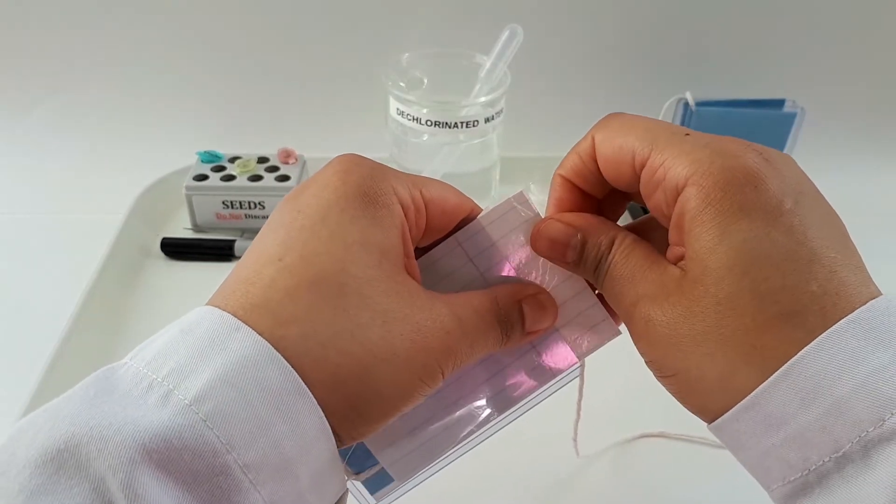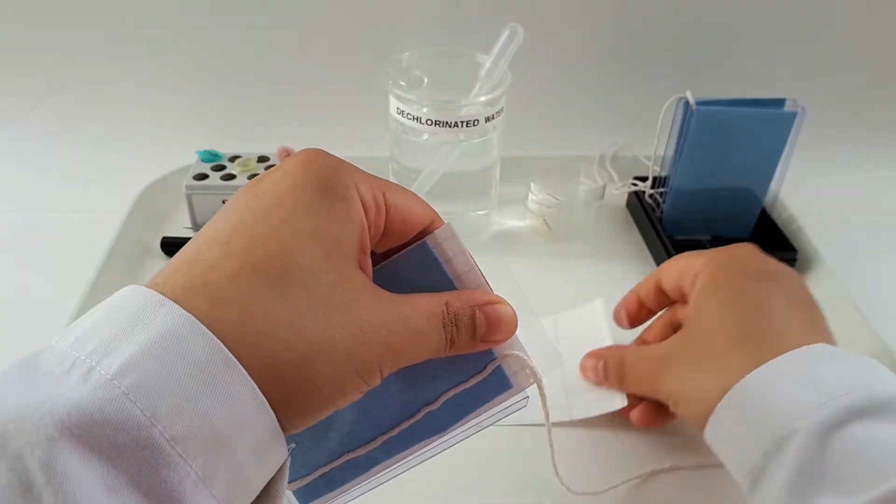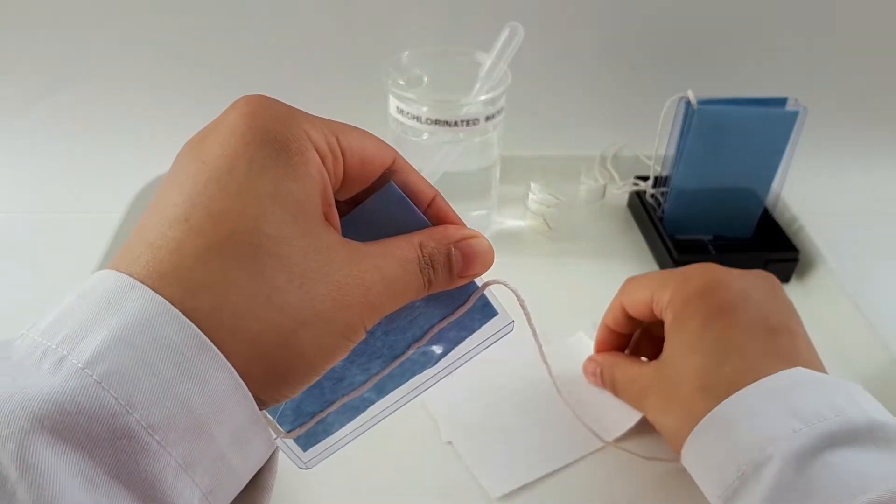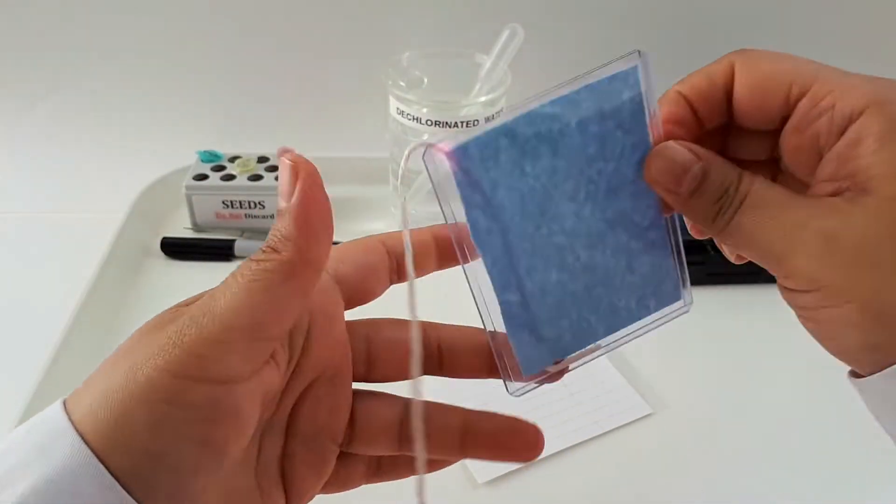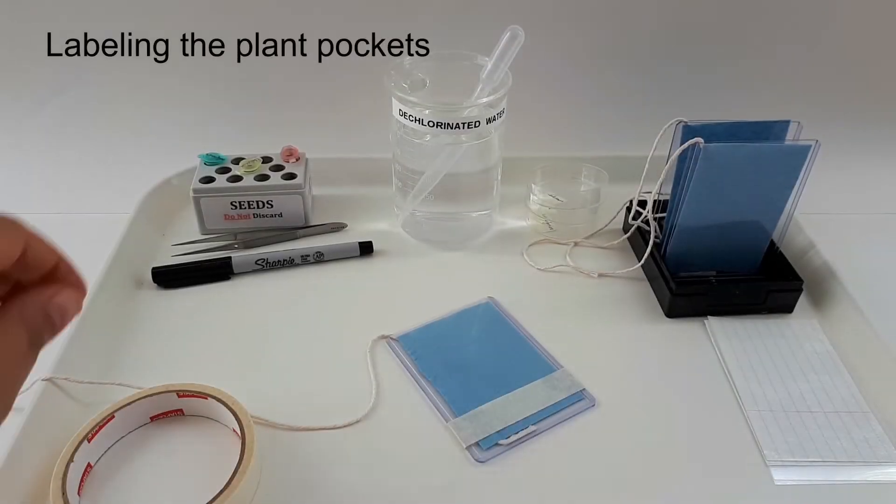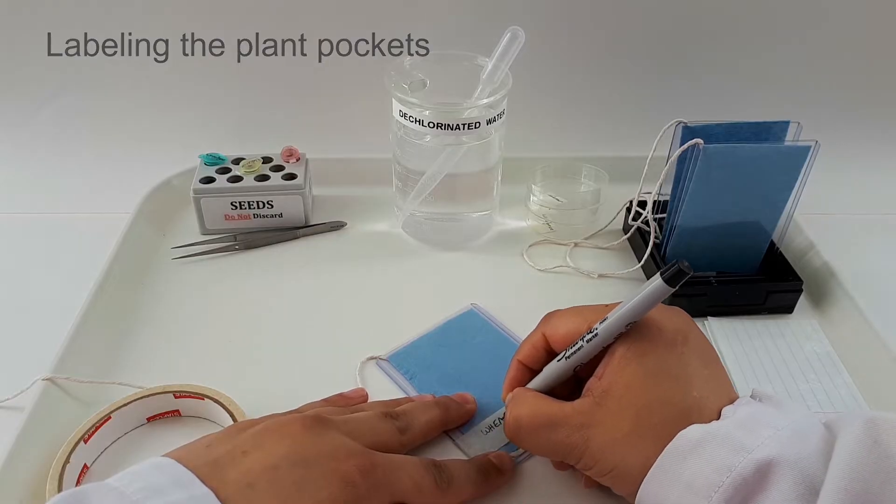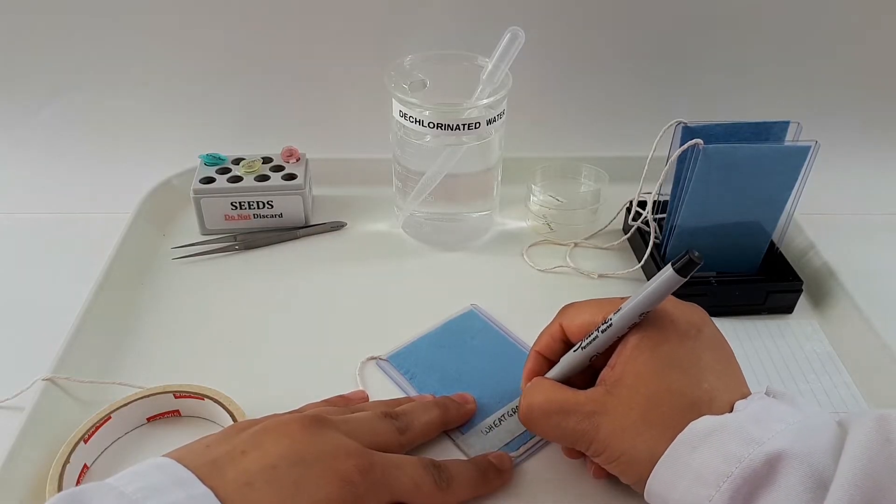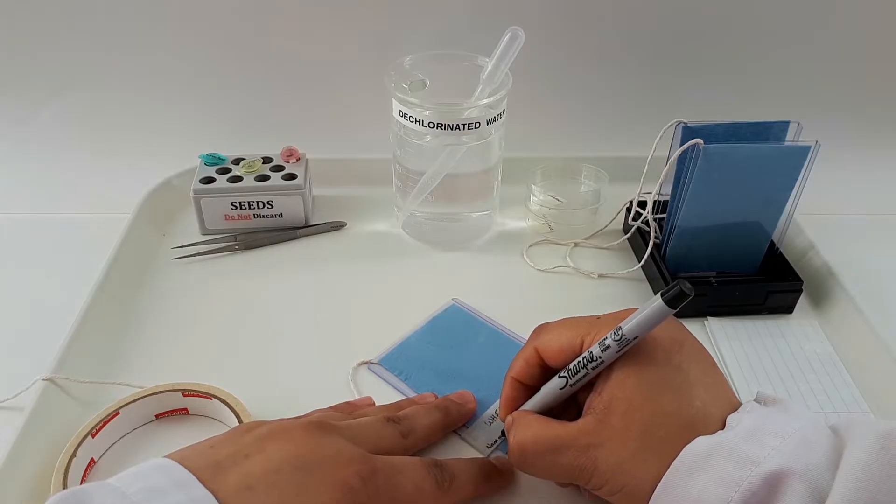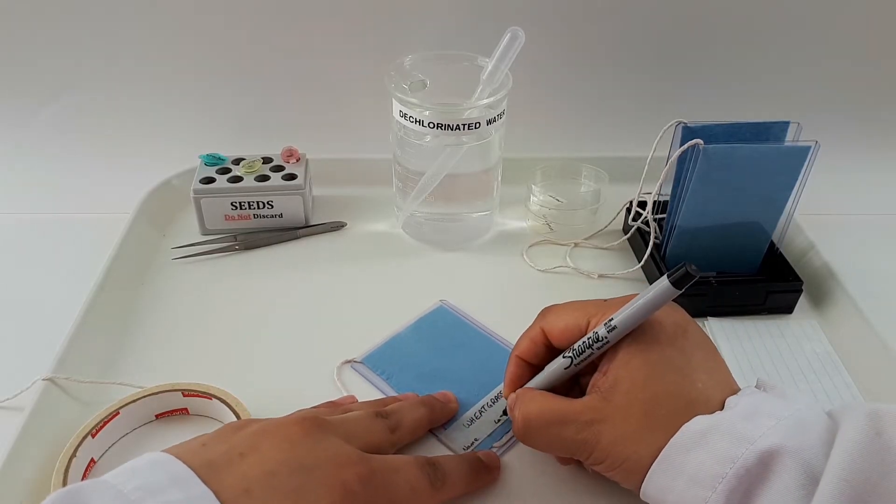Carefully remove the laminated note cards while leaving the shop towel and the string in the card holder. Using the tape and markers provided, clearly label the front of your plant pockets with the seed type, your group name, your lab section, and your TA.